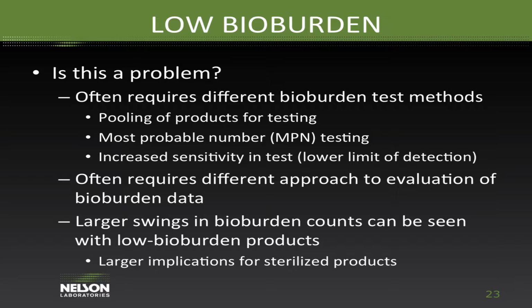So low bioburden is not a problem necessarily, but what we see is that if your product has low bioburden, or if you need your product to have low bioburden, there are some issues that you have to deal with. Often you're looking at different bioburden test methods.